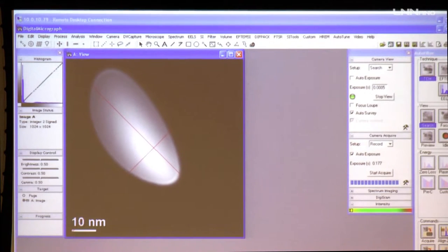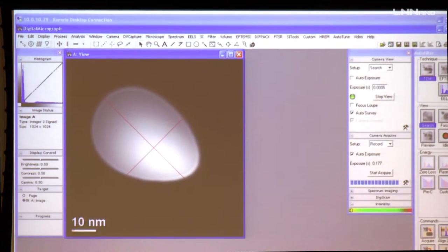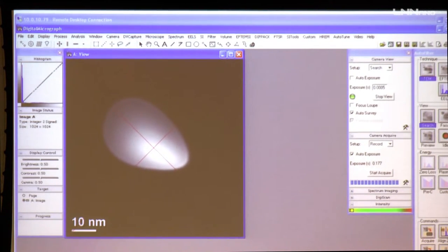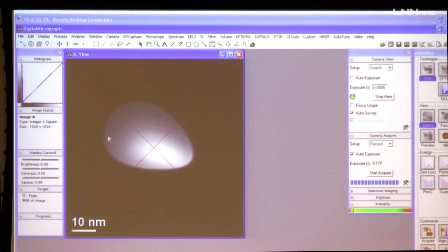And normally, what I'm doing is correcting this astigmatism using the stigmator. It's a small octupole lens built into the TEM, and I'm trying to correct it. Now we can see it's a kind of good equilateral triangle. If I focus a little bit further, somewhere there. So that's good. There we can see it's a kind of equilateral. So that's the image of the source.